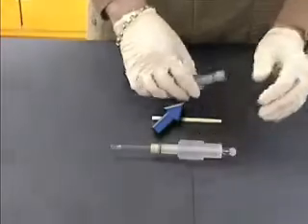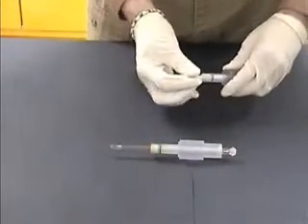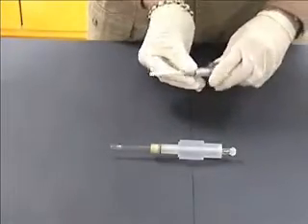For the alumina ceramic type injector, insert the injector from the injector nut side with a gentle twisting motion until it bottoms out. Gently tighten the injector nut clockwise.